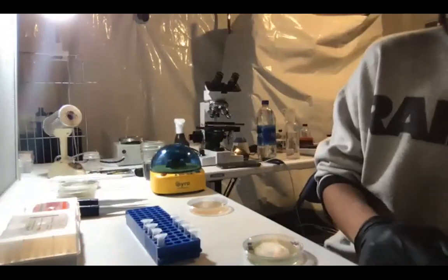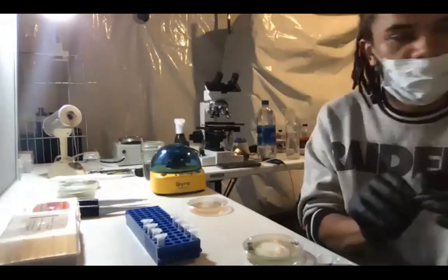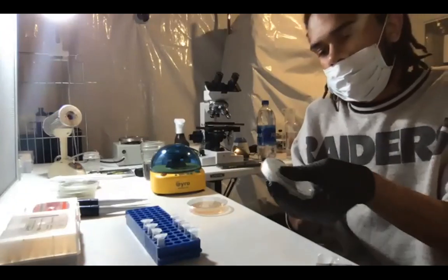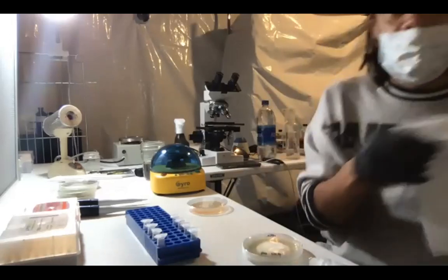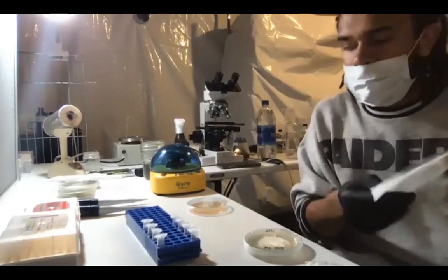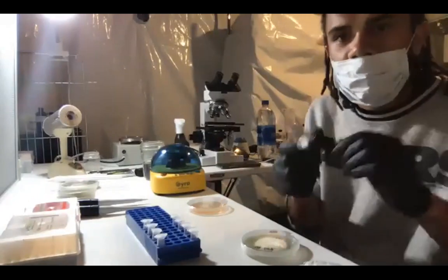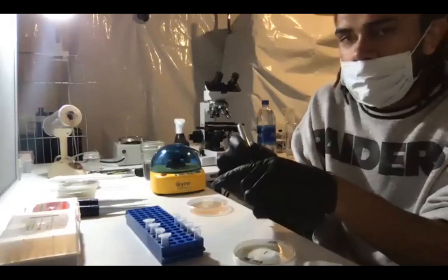And now that I have this sample, I'm going to cover it back up with parafilm, the edges, and I'm going to mark this. Because I sprayed alcohol on it, I need to wipe it off a little bit so I can write on this. I'll just keep this paper towel to use again a couple times. And I'll take my Sharpie here and I'll mark this number one. And then on this centrifuge tube, I'll mark it number one.